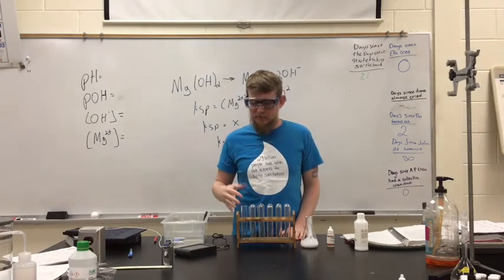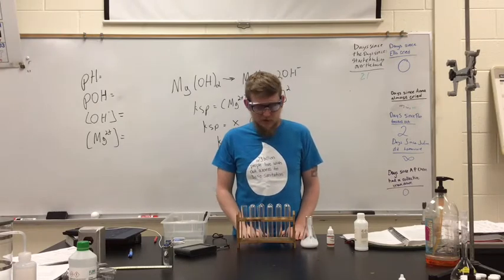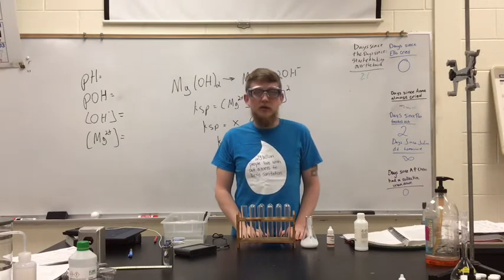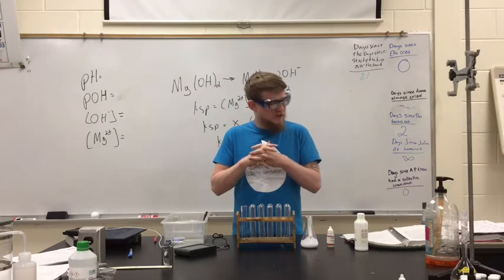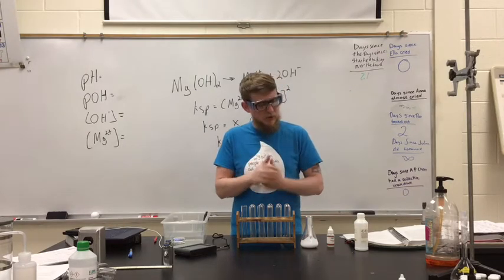We're going to do it very simply first by using our pH probe, and then you guys are going to do it in a much more complicated way when you actually do the lab. There'll be a titration and a little bit more detail to it, right? But this is really easy what we're going to do right now.